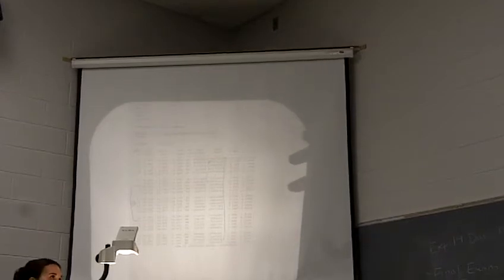Are you supposed to keep the unknown out of the total? Yes. Like on table number 2, that's why you had to recalculate that area, because you had to get rid of the unknown peak, or however many unknown peaks you have. Okay, so again, it should add up to 100%.